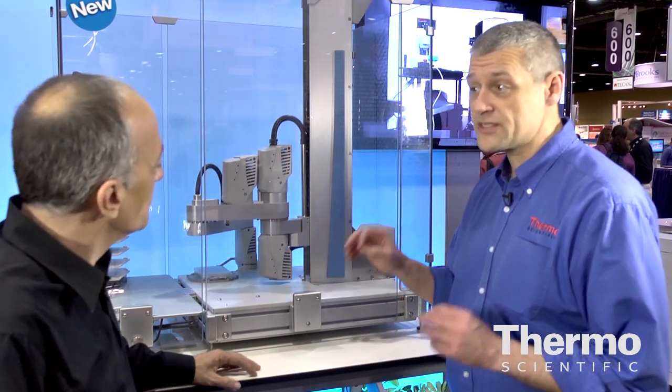Finally, it comes with Momentum. We're running Momentum 3.2 workflow software, which gives customers the best user experience available because they now have the ability to have routine sample process analysis handling capabilities.